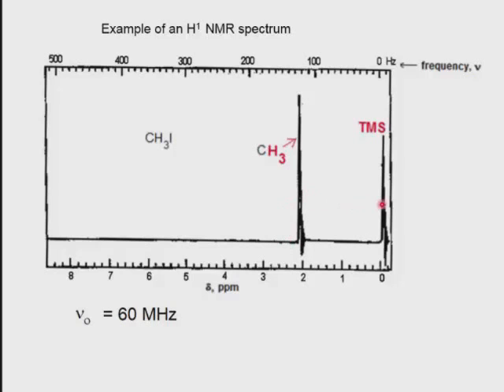You also see a second signal peak at the far right. This is due to the TMS protons. TMS is the added standard. Now we always add TMS to an NMR sample, and we always see a TMS peak in every NMR spectrum. It's always the rightmost peak in the spectrum because the TMS nuclei are in the densest electron cloud environment. And this is due to the lower electronegativity of the silicon atom compared to carbon.